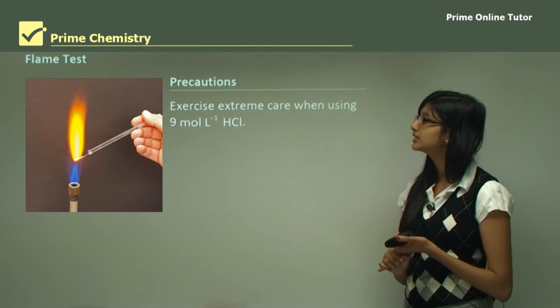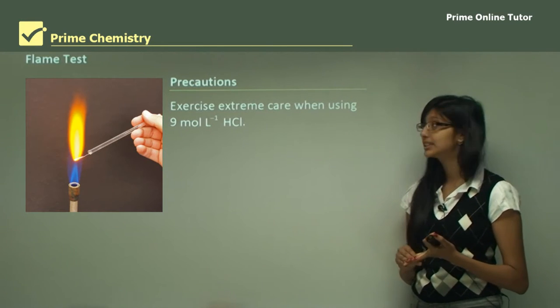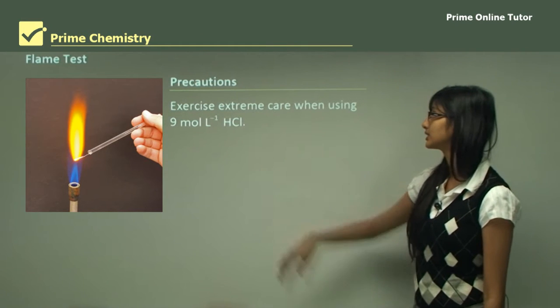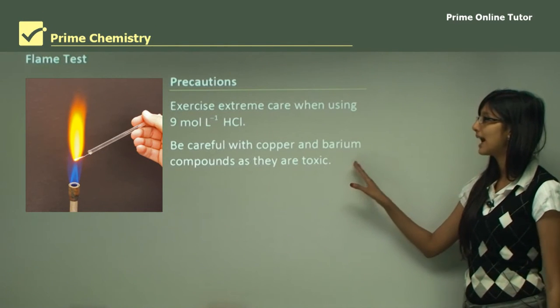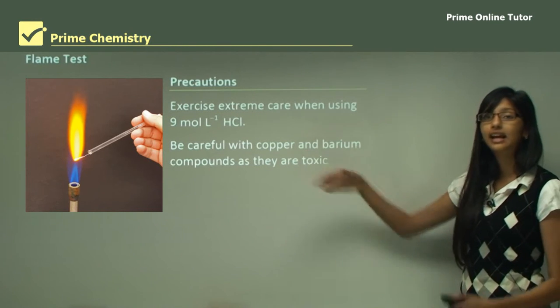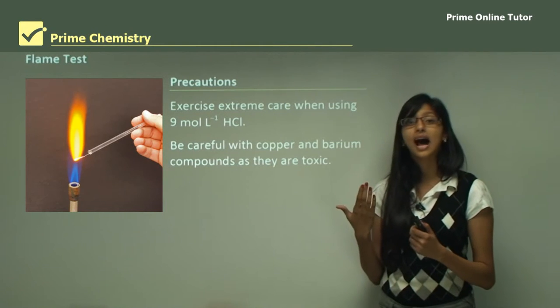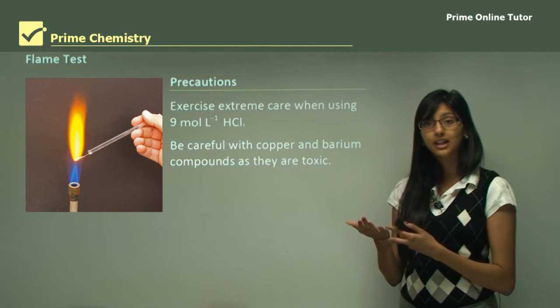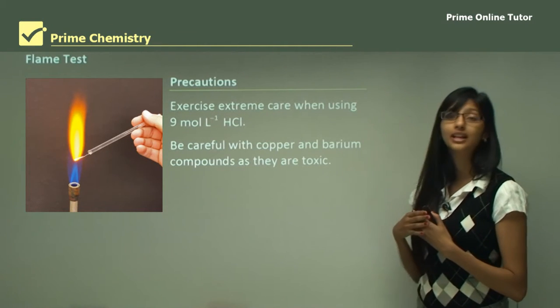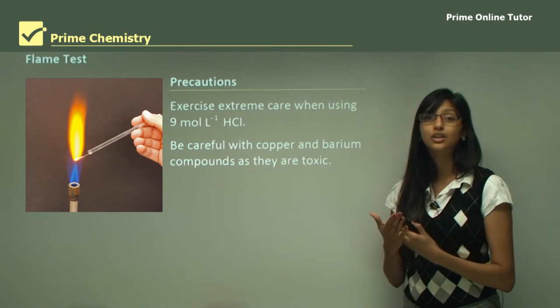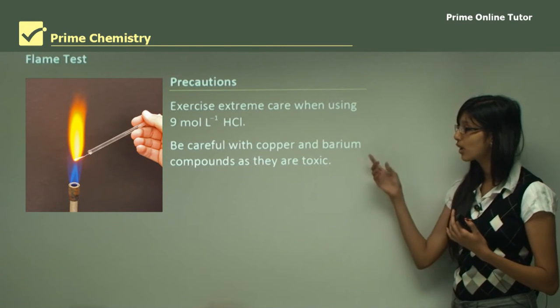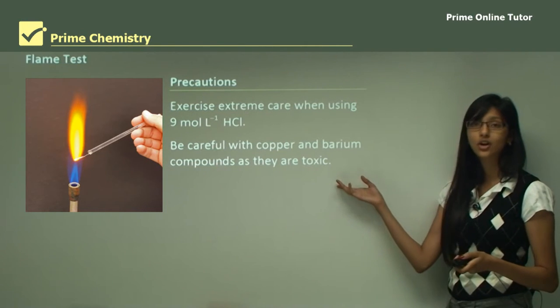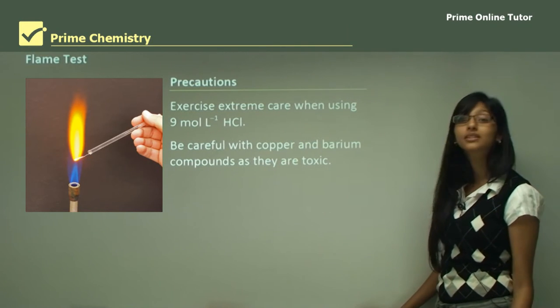There are some precautions you need to know before performing this investigation. First, be very careful because you are using concentrated hydrochloric acid at 9 mol/L, which is very concentrated. You also need to be careful with copper and barium compounds as they are toxic. Hydrochloric acid can burn your skin and cause irritation to your eyes and respiratory system, so you must wear proper gloves, goggles, and safety glasses throughout the experiment.